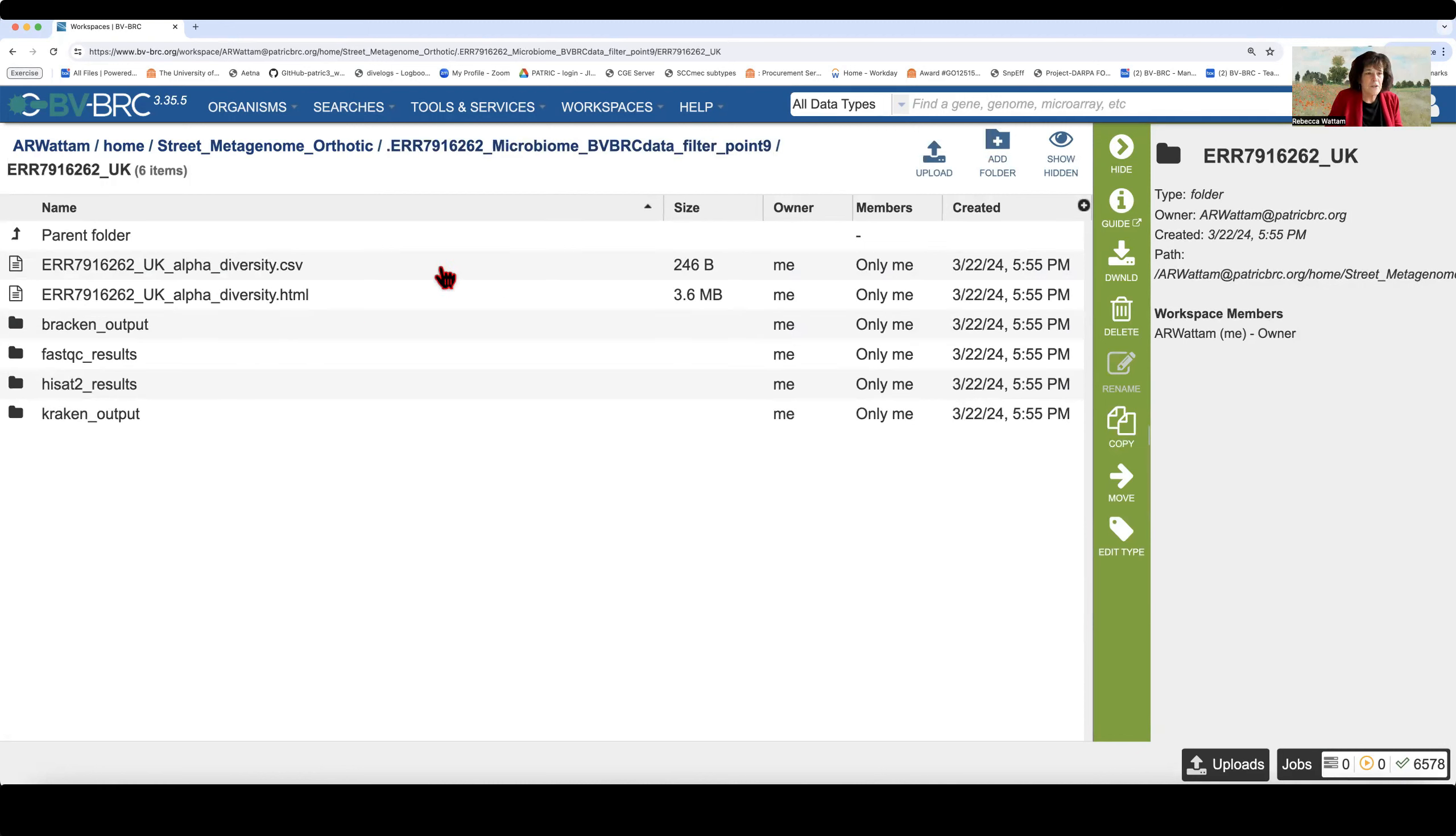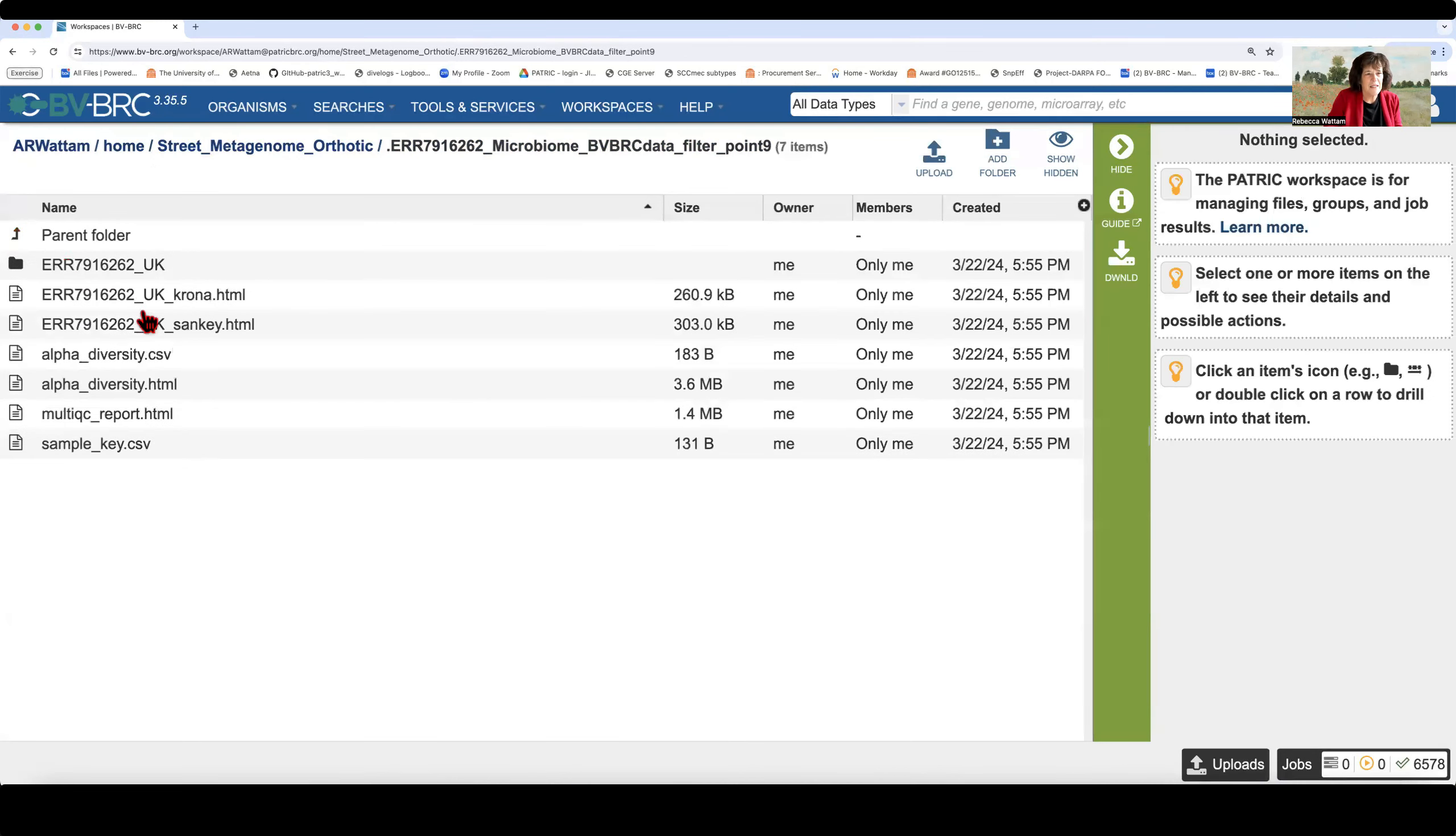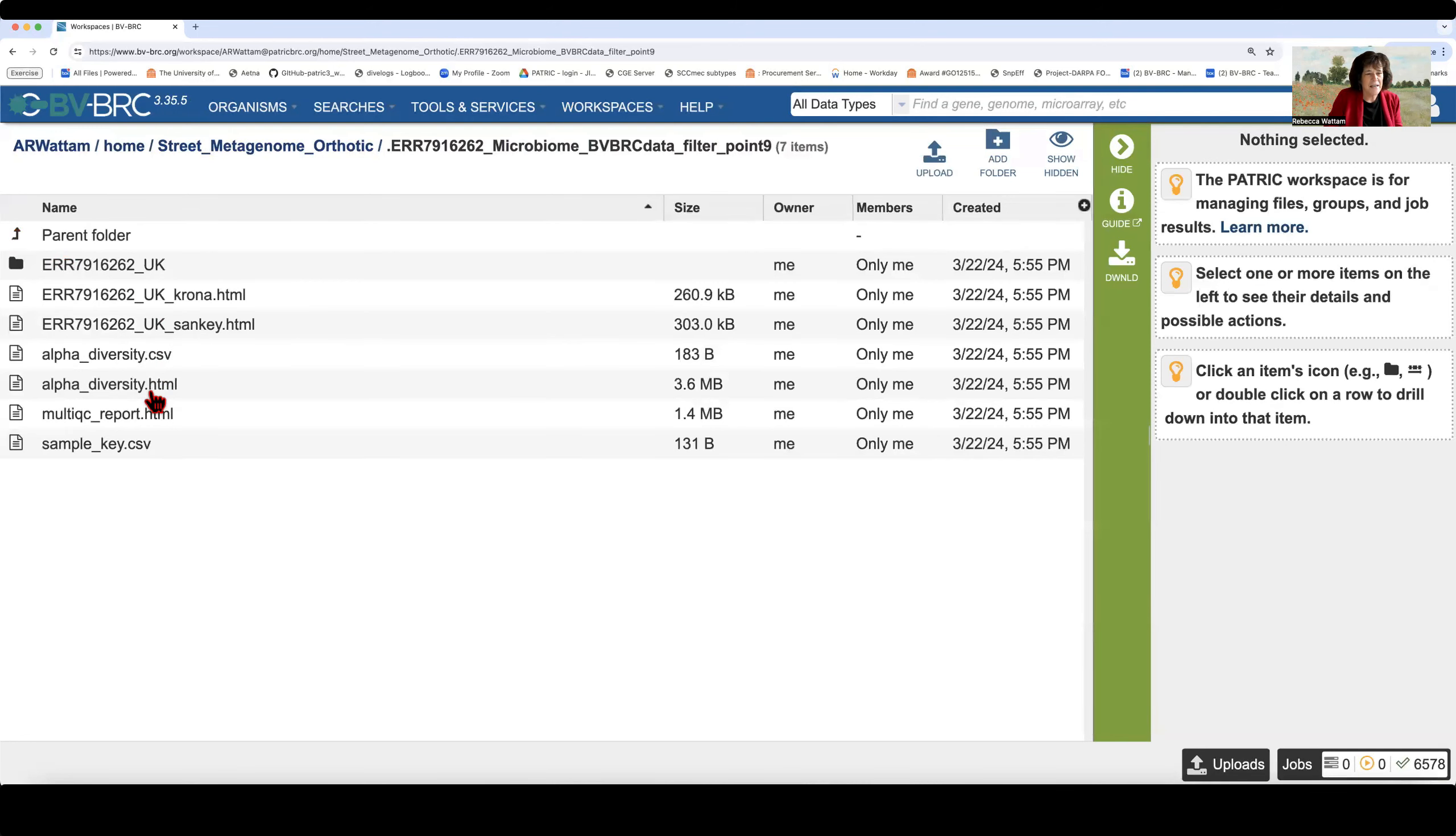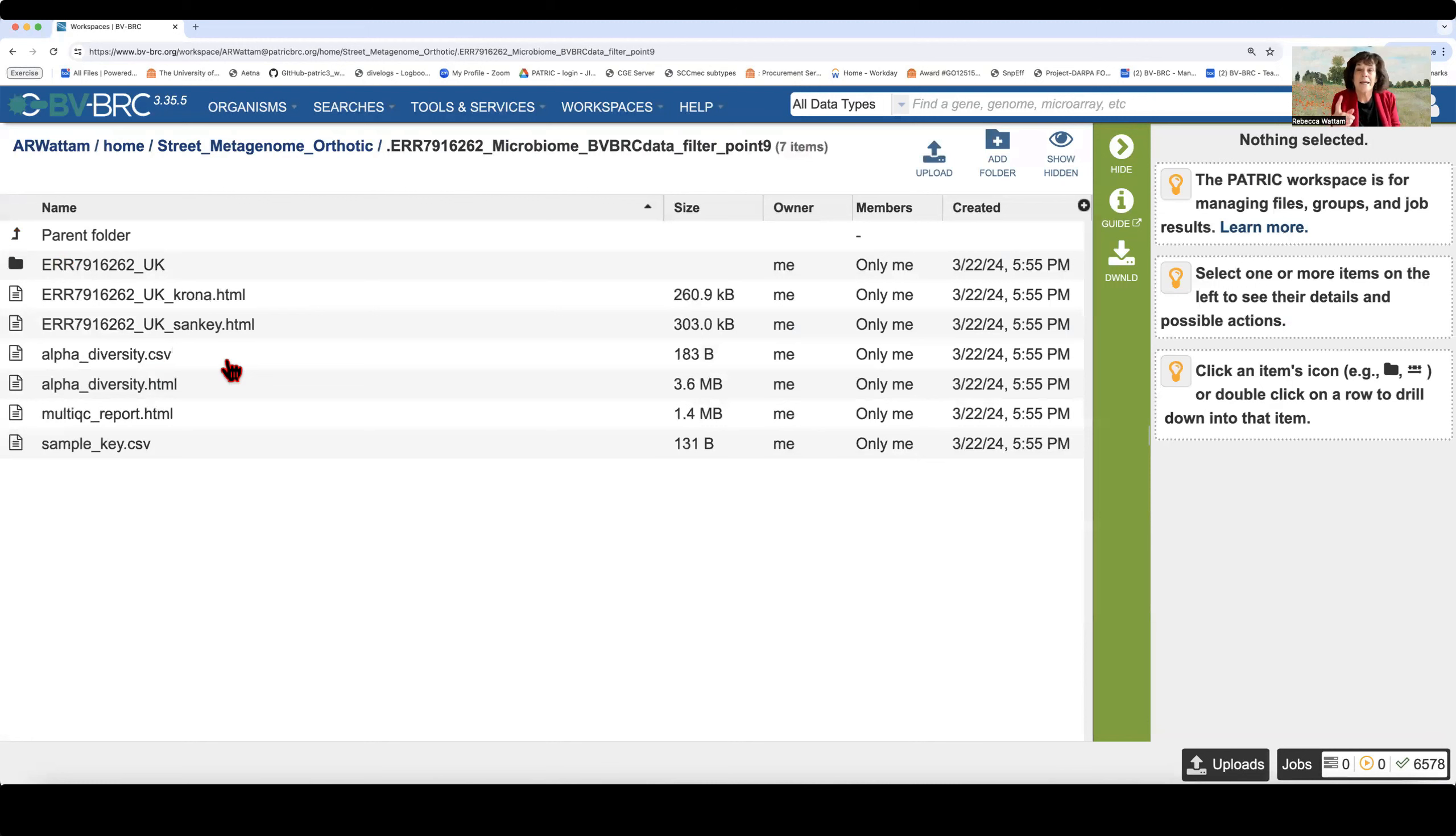And the first thing you see is, oh, there's my sample identifier and alpha diversity CSV in HTML. Hey, wait a minute. Didn't we see that earlier? So let's click on the up arrow here. And well, there's alpha diversity. It doesn't have the sequence identifier, but is this some strange bug in the system? Why do I have to see this twice?